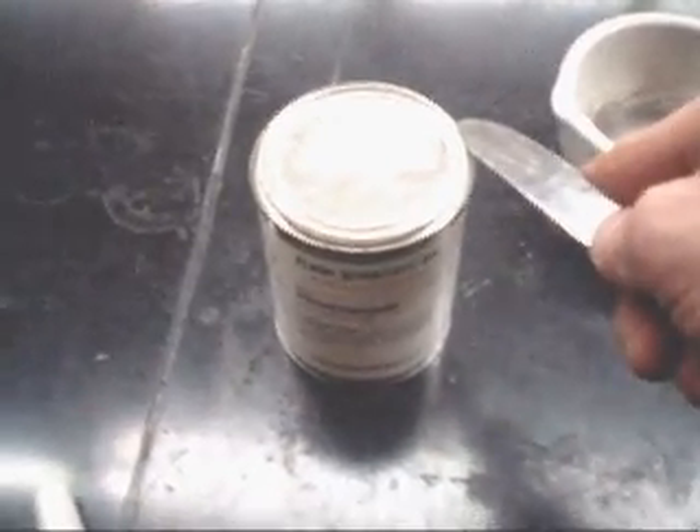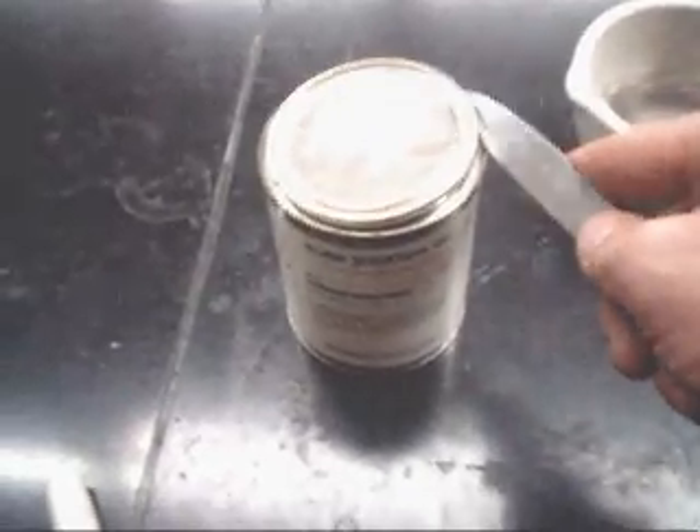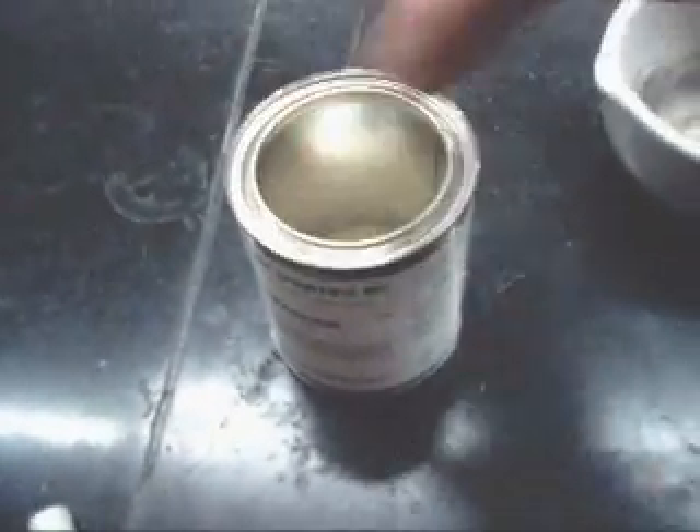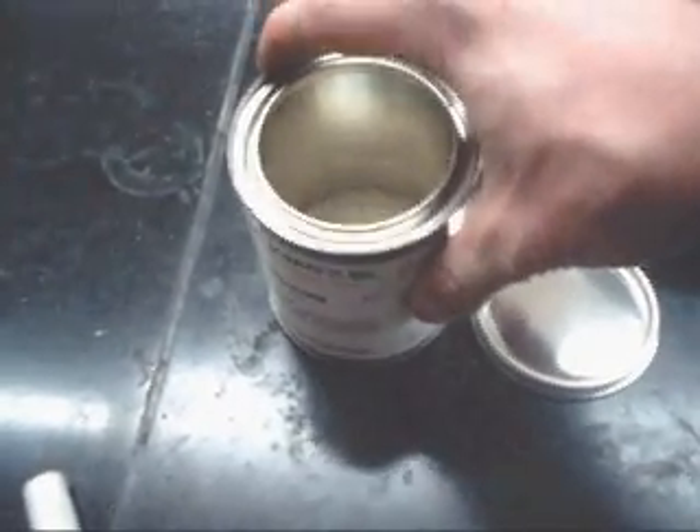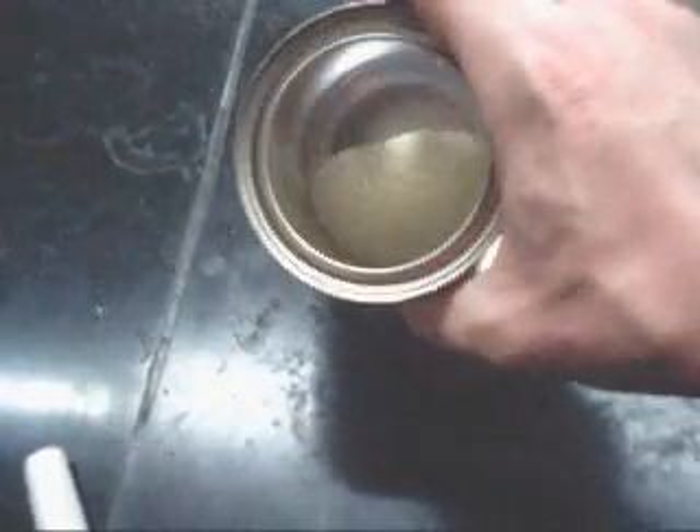Sodium peroxide comes in these very tightly sealed cans of metal, for good reason. We don't want it to react with any of the water vapor that's in the air, but more importantly, when it does oxidize and it gives off the oxygen gas, it produces a lot of heat. If you're producing oxygen gas and a lot of heat, those are two of the three things you need for a fire. The only thing that you're missing is fuel.